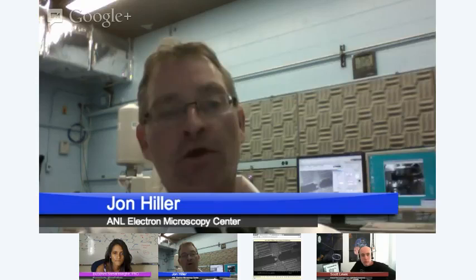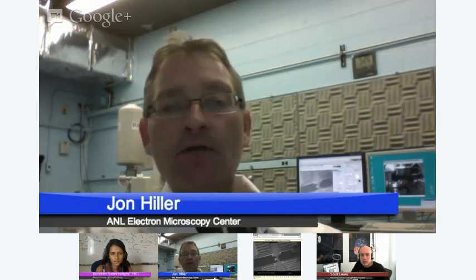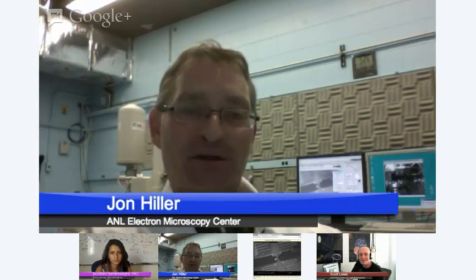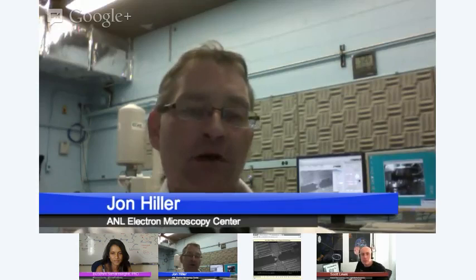Oh, that's really cool. If you're fabricating something, you know, you're making something, and you really don't know where, like a lithium-ion battery, well, where did the lithium go? Right. And did it migrate from point A or point B to where did it go? And why is it not working anymore? We can then set the microscope parameters up and tune it up to detect lithium, the signature peaks of lithium, and find out where it is. Now, I use lithium as an example, but that's a bad example. But you know what I mean. So if you're fabricating some type of material, you can figure out where these elements are dispersed.